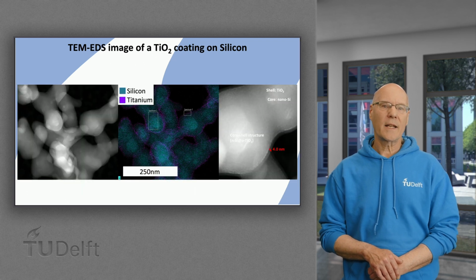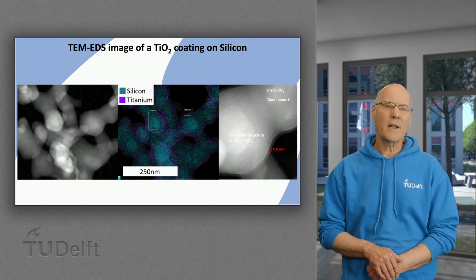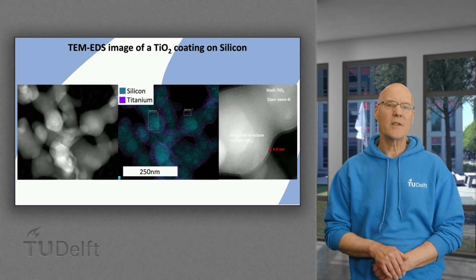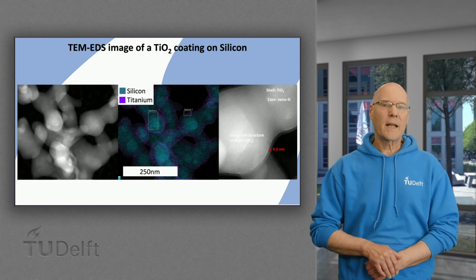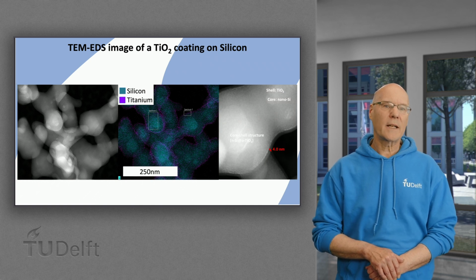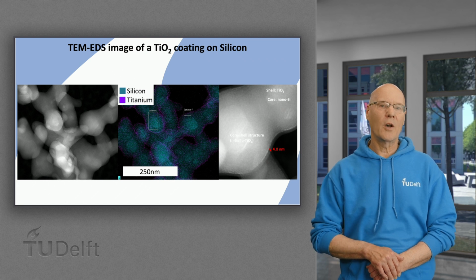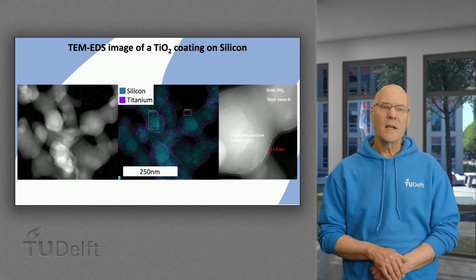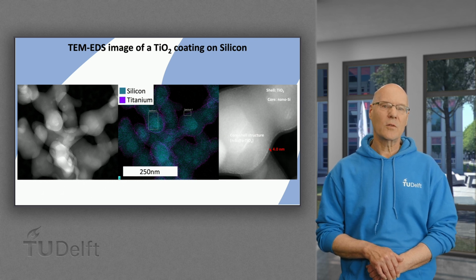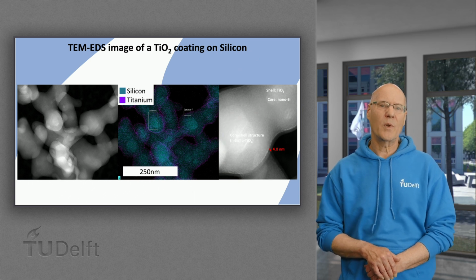Similar as in scanning electron microscopy, SEM, incoming electrons may have enough energy to promote an electron from a lower energy level to a higher energy level. Once an electron has been removed, it is possible that other electrons in higher orbitals fall back in the created electron gap under irradiation of X-rays. These X-rays can be measured with what is called EDS or EDX, energy dispersive X-ray spectroscopy.